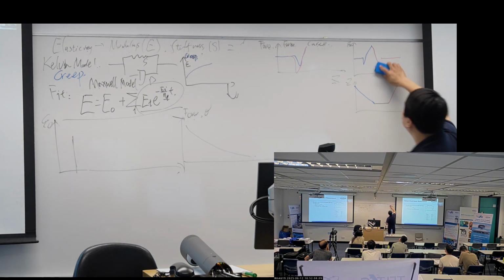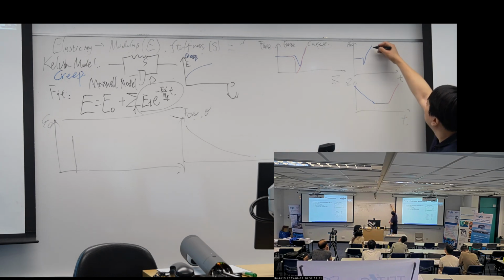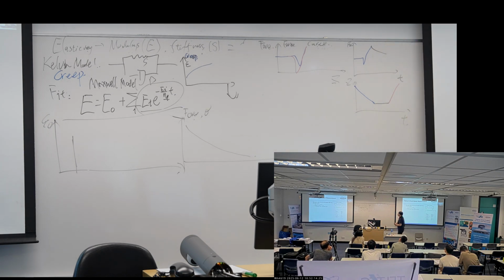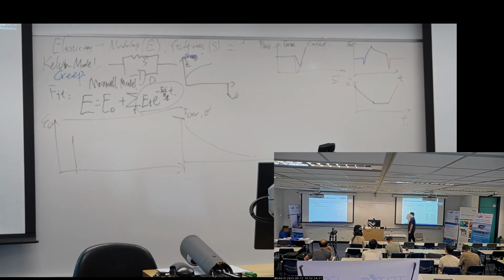So I expect to observe something like this. And then that will be my final force curves.